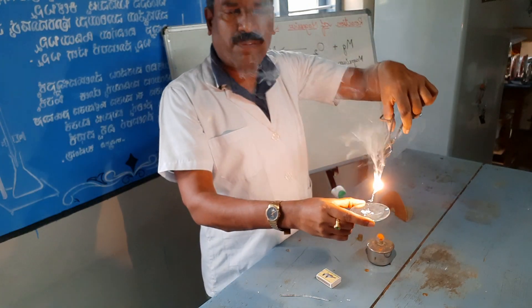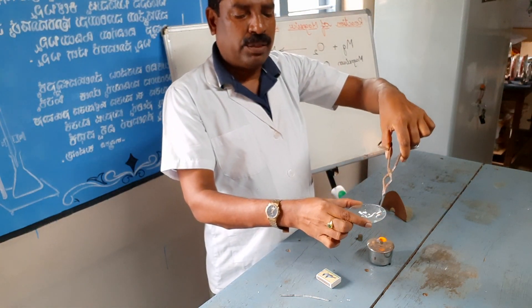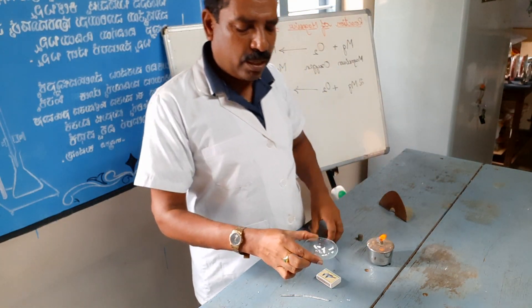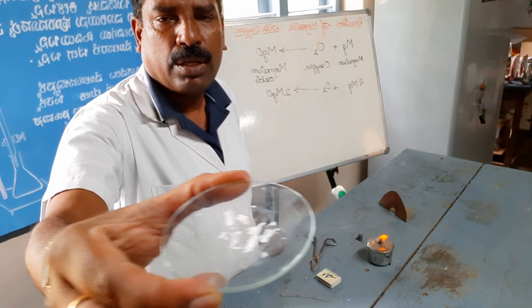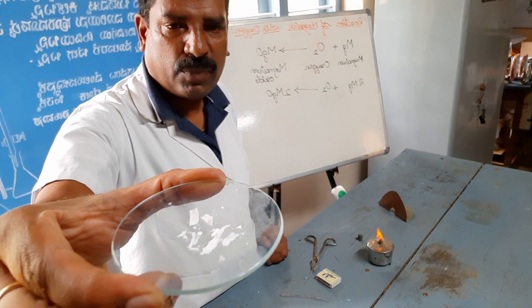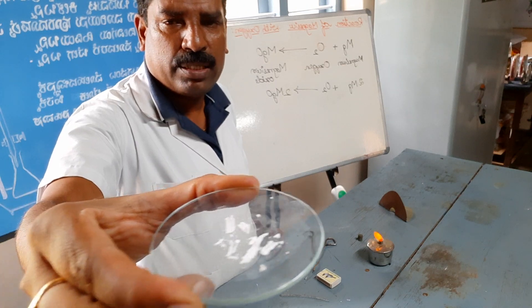This is one of the basic oxides — a basic oxide. You can observe the magnesium oxide in this watch glass.